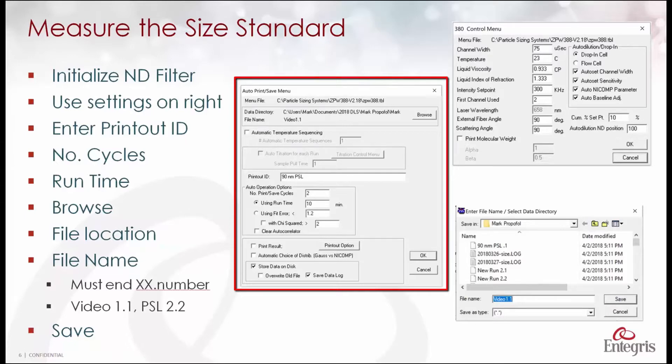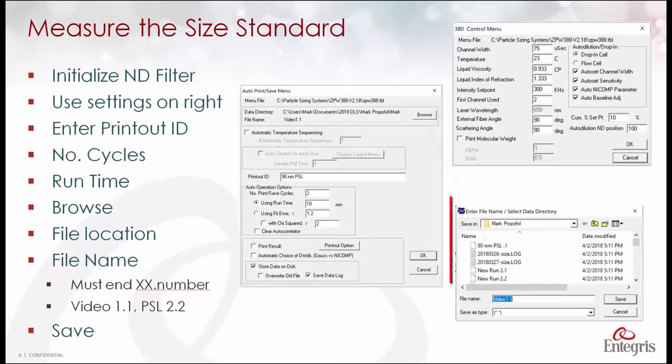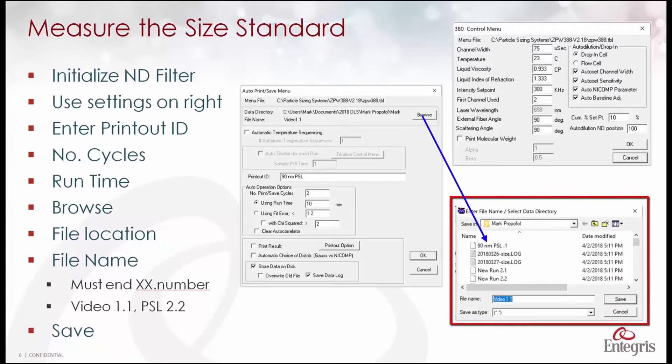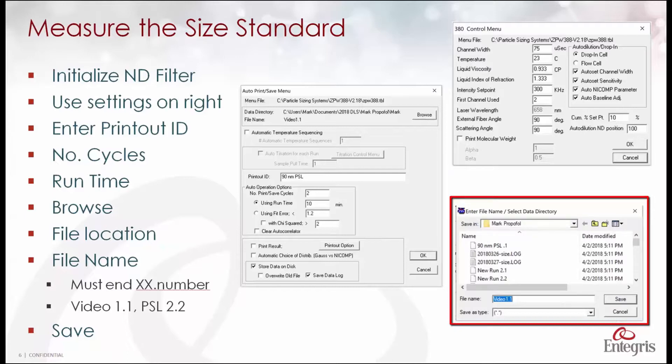Then we're going to save each measurement as a file name. If we click on browse here in the lower right we're going to choose the file location and then a name for this measurement file.